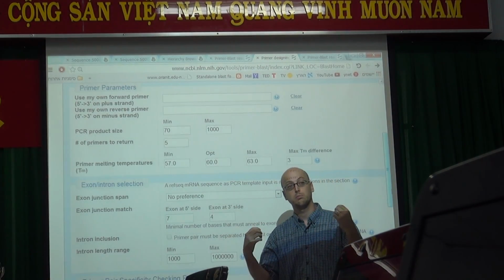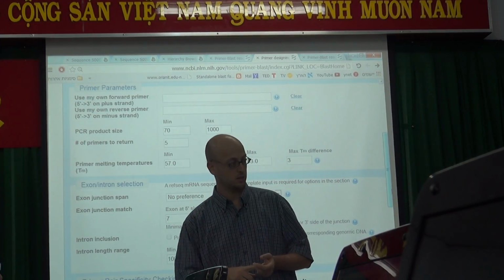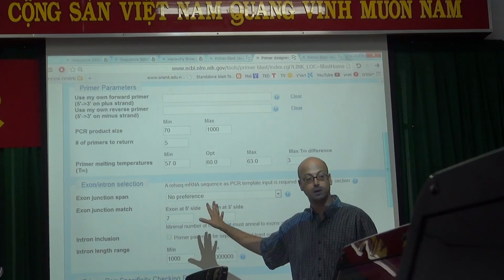If you are designing PCR primers for plants or fungi or protozoa, then you will need to use this, but I will not talk about it now.